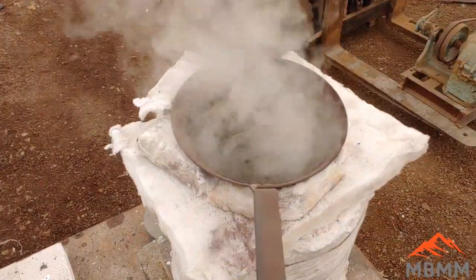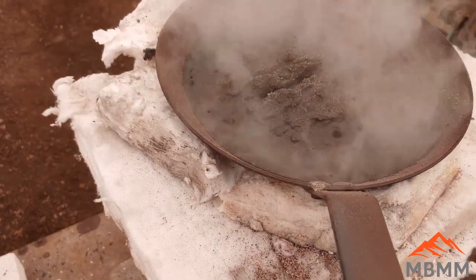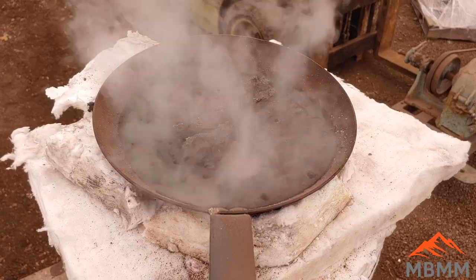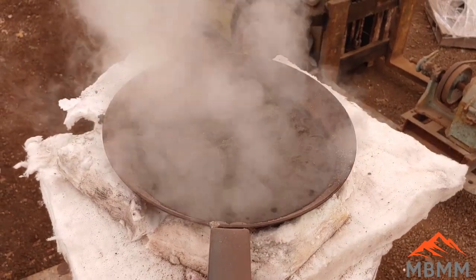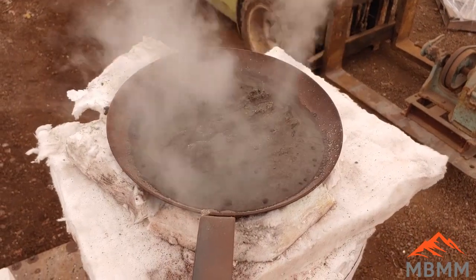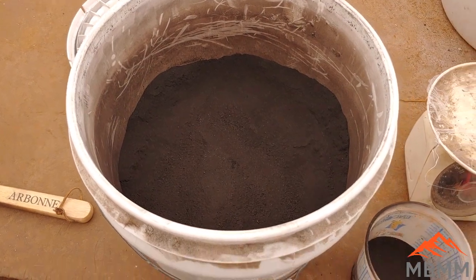Most of what you're seeing is the water being driven off from the panning tailings. But it's really important to wear a respirator when you're doing this, because a lot of SO2 is driven off. If you breathe it in, it mixes with the water in your lungs and turns into sulfuric acid in your lungs — something you really want to avoid.